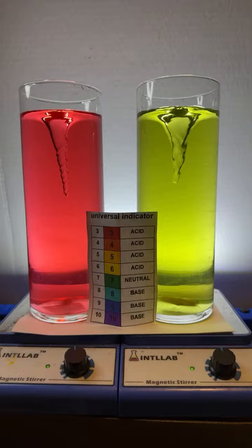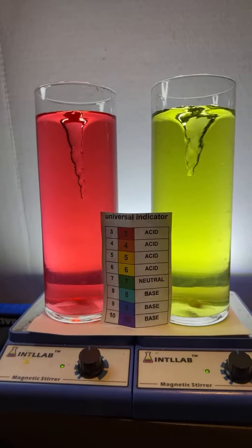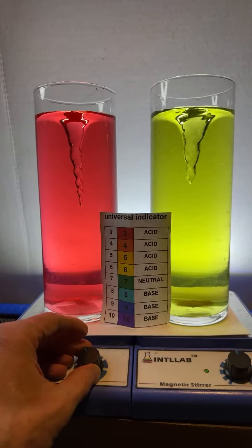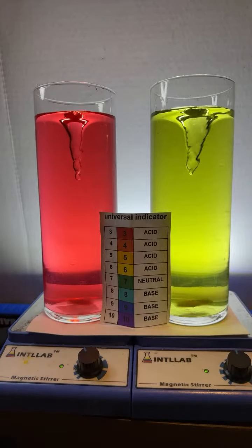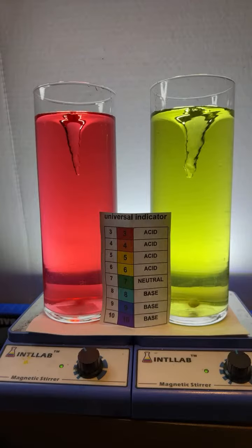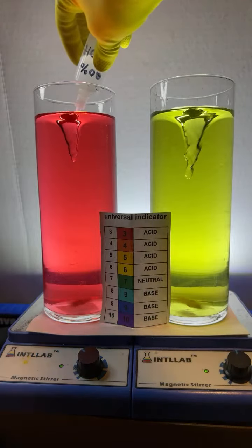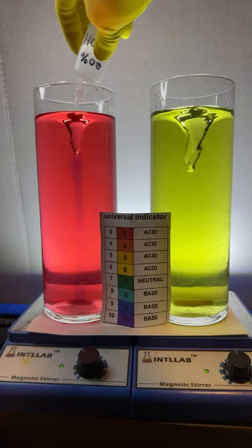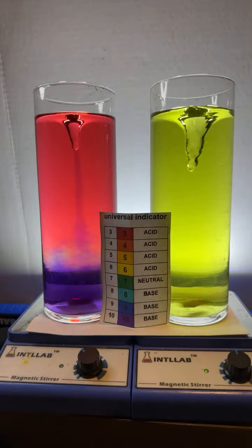Can you tell what the chemical formula or scientific name of universal indicator is? It is a mixture of chemicals. The mixture of chemicals in universal indicator include thymol blue, that's really the backbone of the indicator, methyl red, bromothymol blue, and phenolphthalein. Okay, to this one over here on the left, I'm going to start adding drops of base to the middle. And you can see that the base tends to stay in the center of the vortex. Of course, still it gets pushed down to the bottom.